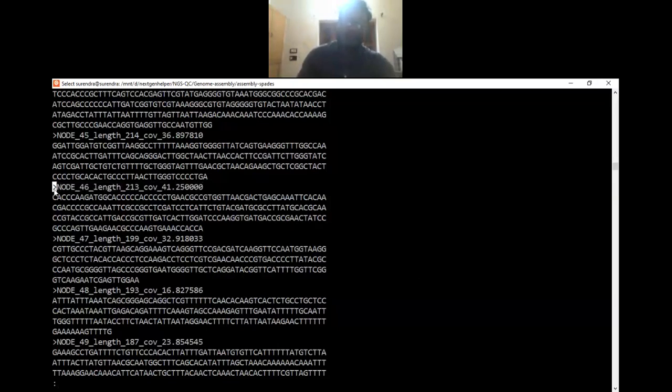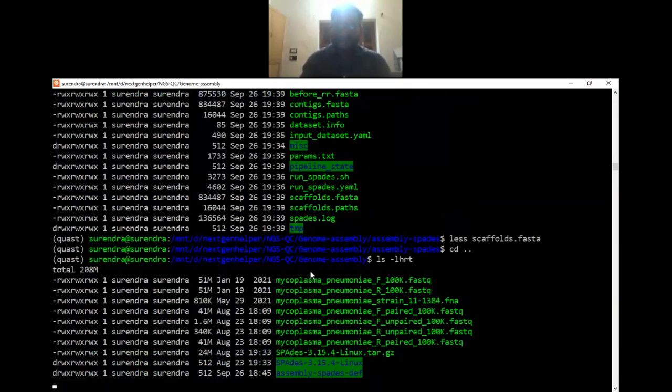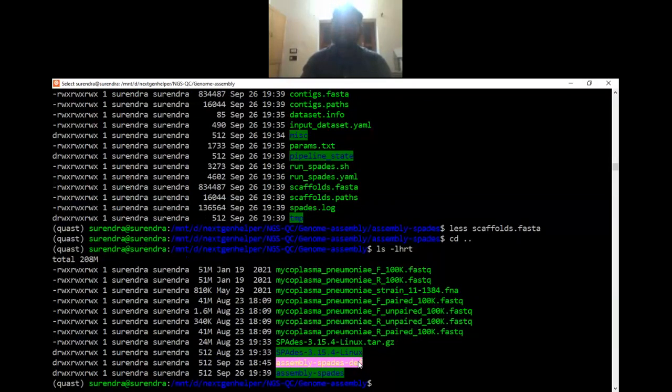Okay, so we have here 46 sequences longer than 200 base pairs, but we had a lesser number of sequences in the defined K-mer. So now we have seen that, till now, the number of sequences is telling us that we have the best assembly from the defined K-mer output. This is the defined one. Okay, but is it really right? Is it really correct? So what we can do, we can check the quality of the assembly using the Quast tool.